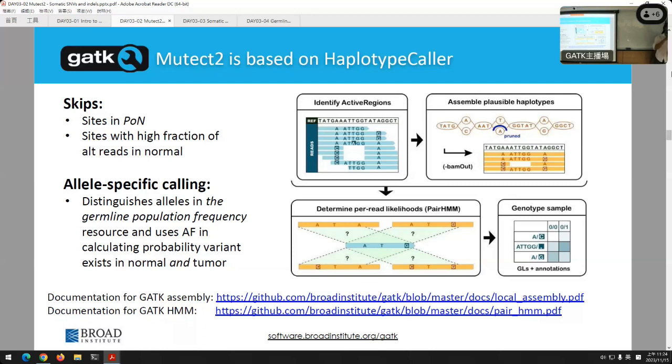I know functionally what they do there. I have not gone into the code for that part, but that's part of the reason, I believe, why we try to group by allele frequency as opposed to just making assumptions of ploidy and what that would look like. The fact that we might have a lot of different alleles that show up at different rates in our cancer cells, we had to change that part so it didn't break HaplotypeCaller. So we can account for the fact that alleles might show up at different frequencies that might not be 50-50 or something else. We didn't want to assume. Also, remember Eric mentioned we might have a lot of different copies there. So that's why we had to change that part. I'm not sure if that 100% answered your question, but that change was meant to account for the fact that alleles show up at different rates. If that didn't answer your question, do feel free to come up afterwards.